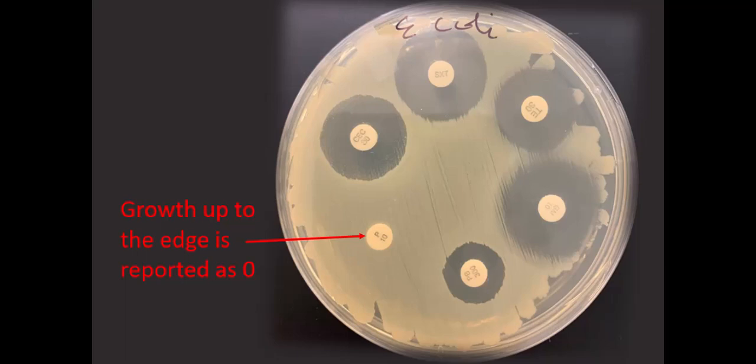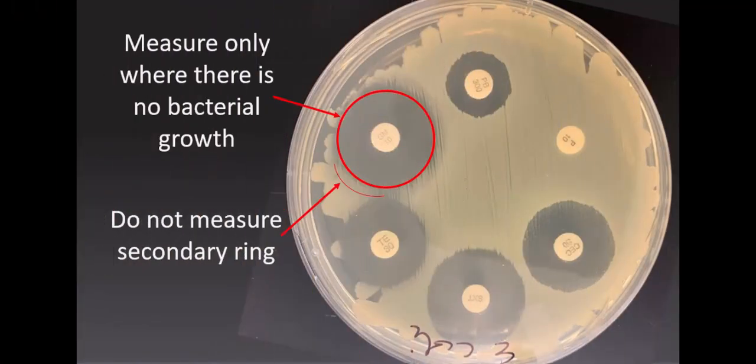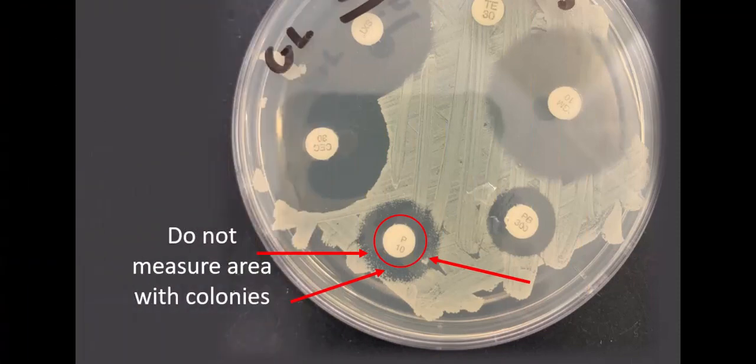Sometimes the results aren't quite as clear-cut. You may see two zones, a smaller one very distinct and clear, and then a larger one a little less distinct. Measure only up to the distinctly clear zone lines. If there is a zone of inhibition that has colonies inside the zone, those bacteria may be resistant to that drug. You can only measure the diameter of the area with no colonies.